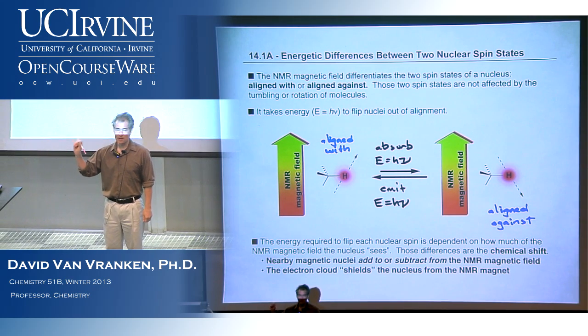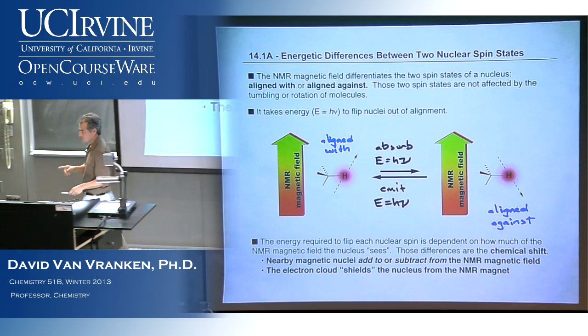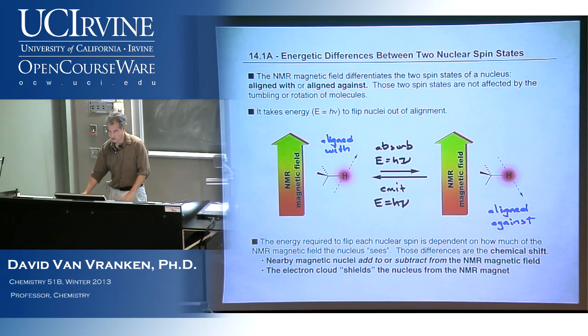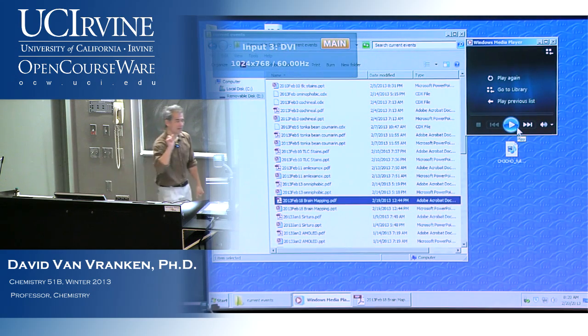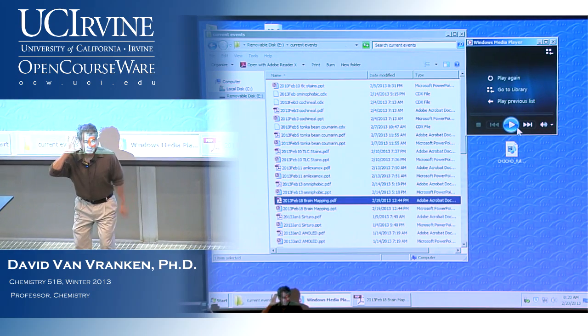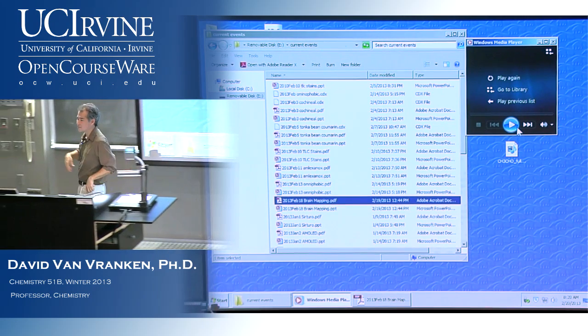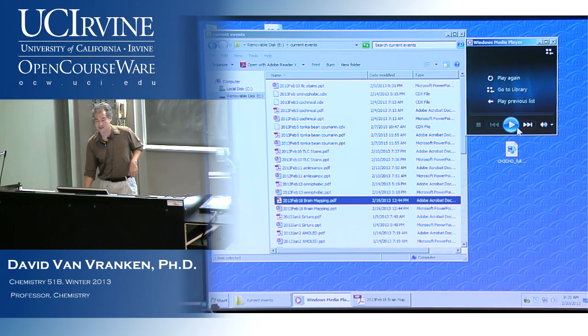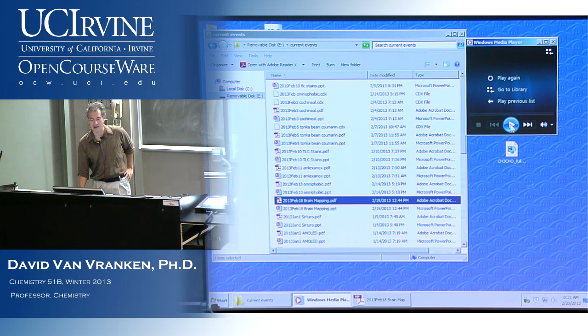At the beginning of the lecture, I played for you this sound. I'll try to take this thing off the screen for a moment so you can hear that sound in all of its glory again. You're listening to an NMR experiment. What's happening is the NMR spectrometer pulses the sample, and then the spectrometer listens for all the protons in the sample to start giving back their energies at their particular frequencies. So let's listen to a collection of molecules giving back their energy.